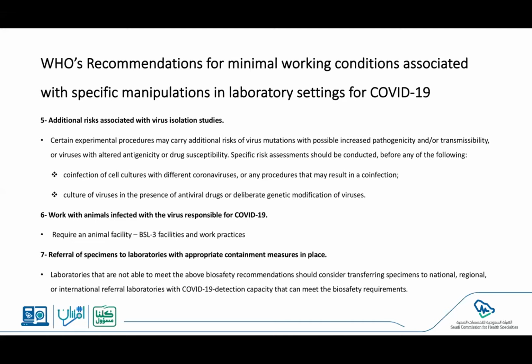And the same applies to the animal facility. If you have any animal work to do with the COVID-19 virus, then you need to consider doing it under biosafety level 3. And lastly, if you don't have these requirements in place, then you need to consider transferring the sample to the regional or national laboratory. And that's all.